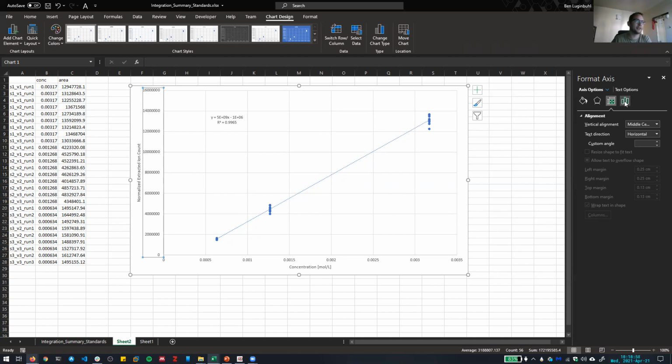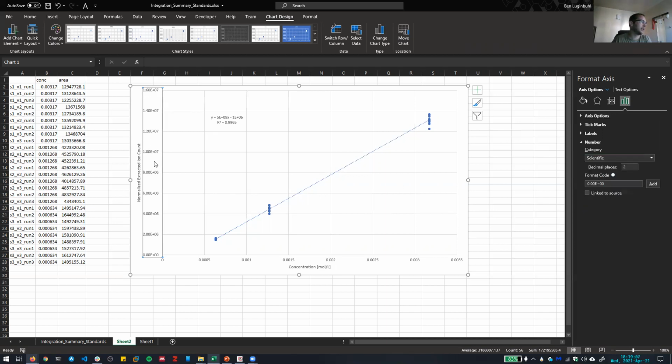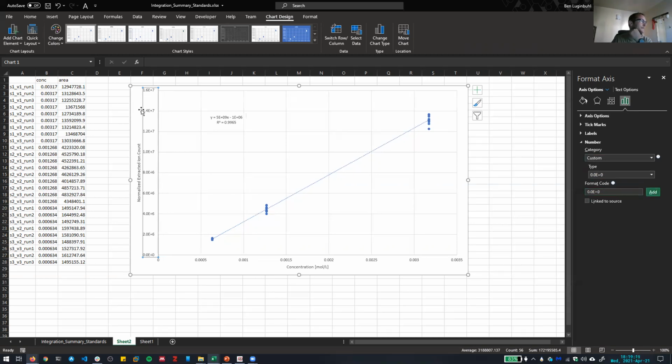But I want to format these. The way to do that is to click over here, click on this number tab, and I'll just use scientific, I guess. That's kind of fine. I'll do a little cleaning up so we don't have any numbers with another decimal place, so I'm going to take that one away. I don't like the two digits for the exponent, so I'll just do that. That cleans it up a little bit. That looks kind of nice.